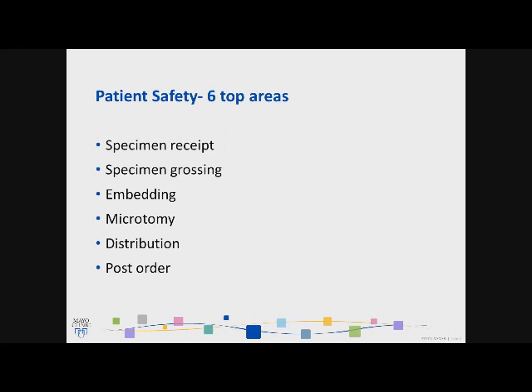I wanted to give an example of the first laboratory that I worked in. It was a small laboratory in southwestern New Mexico, and I was just coming right out of school. I was eager and willing to basically do anything in the laboratory. There were only 2 techs working directly with the consultants, or physicians, if you will, and I was eager and willing to do everything. In this laboratory, there was very little technology. We did all the immunostains and all the special stains by hand.